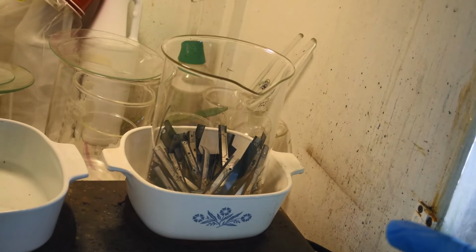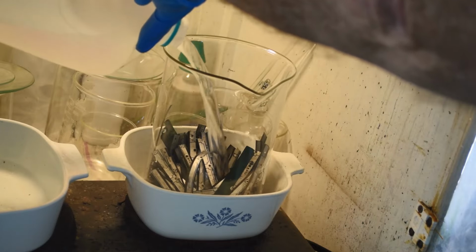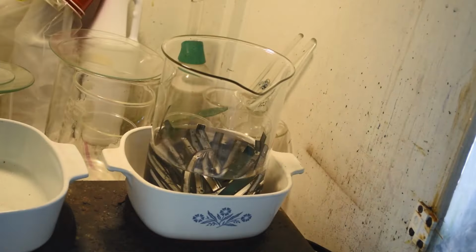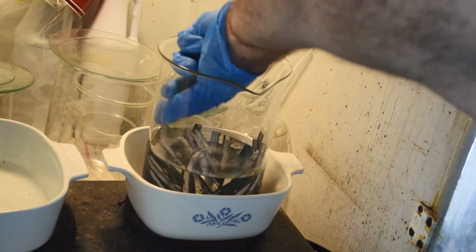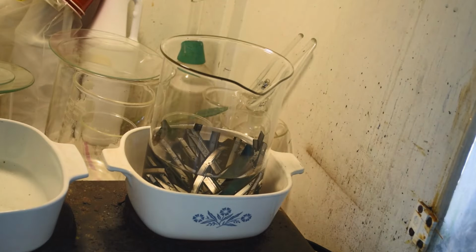Okay, I got our 100-gram test sample in the fume hood. Going to put some distilled water on it. Try and get everything under the water. Not easy. I probably need to cut these into shorter strips. I don't know. Turn the fume hood on.